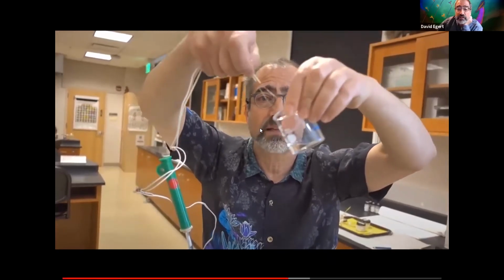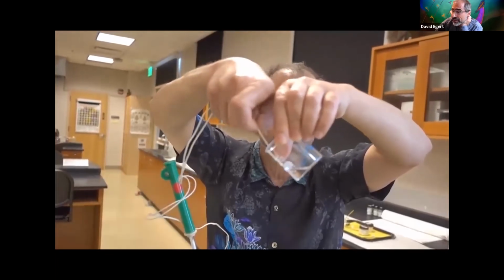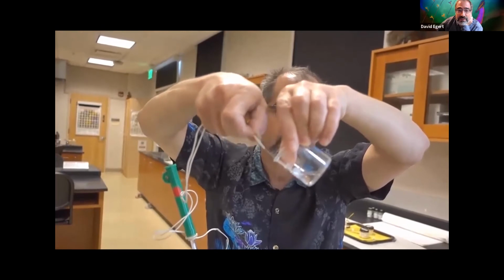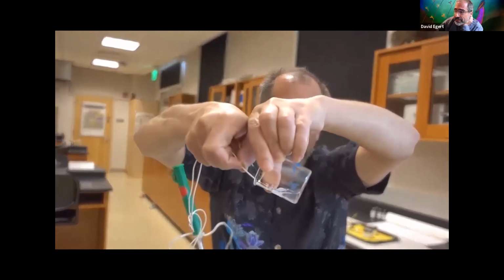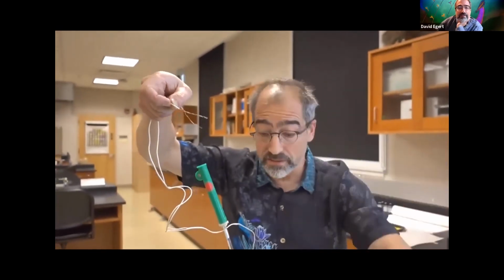So hopefully you wrote down now whether it dissolved or not, which we saw they all dissolved. Now we're looking for electrical continuity, how well each of these solutions conducts electricity. Can the electric current flow from wire to wire through the solution, which will be evidenced by, let's find out, with bated breath. Here we go, let's see what happens. All right, so in the air, I don't hear anything. In calcium chloride, I hear a buzz.